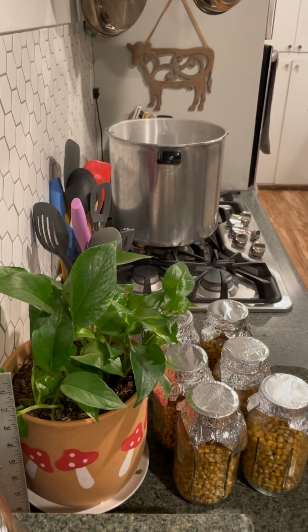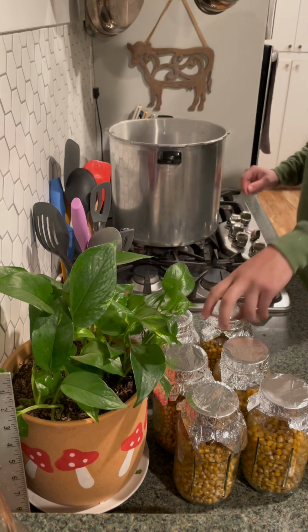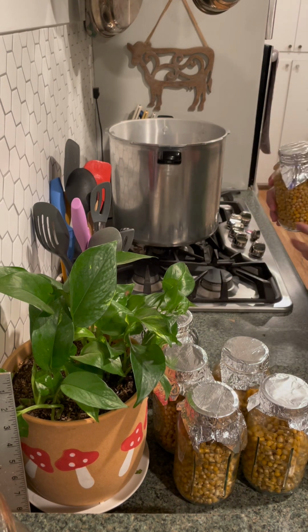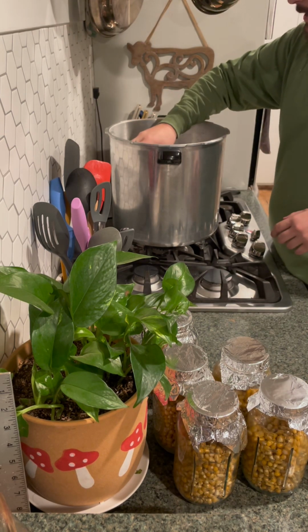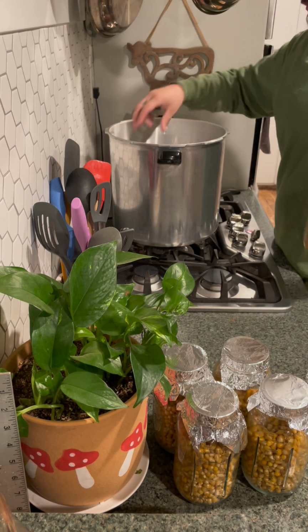All right, now the non-drippy corn is drying right now, and I already got the drippy corn in the jars. I put 460 grams into every single jar. That's the same thing I'm going to do with the regular corn once I'm done with this. But now I'm ready to sterilize, so I'm going to put it in the pressure cooker. I'm going to sterilize at 15 psi for 2 hours.